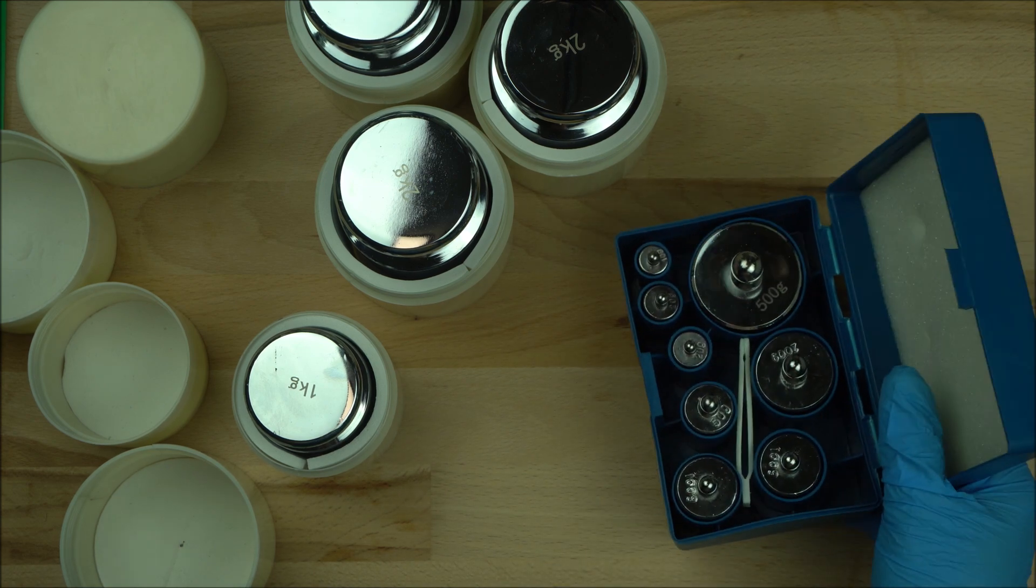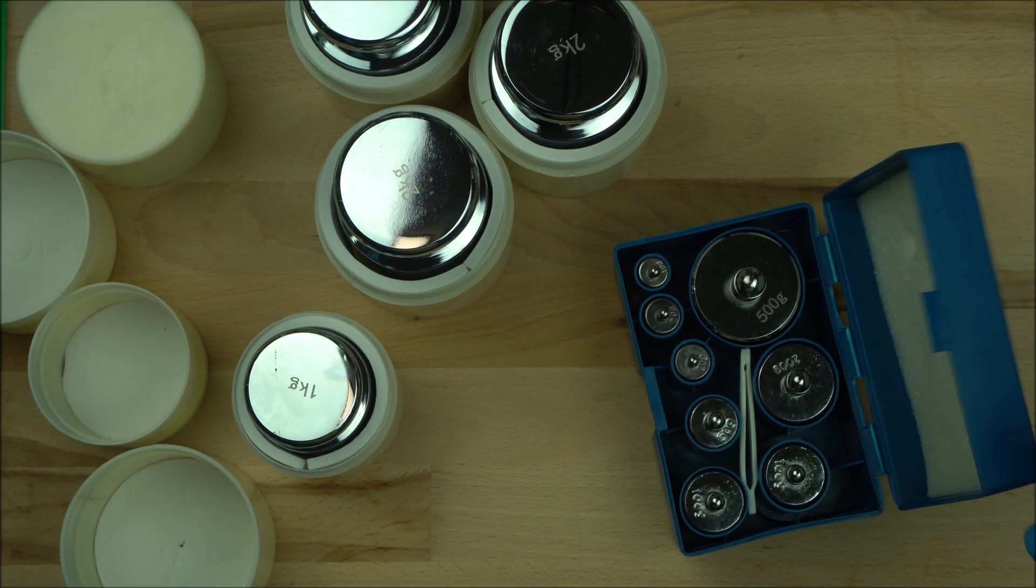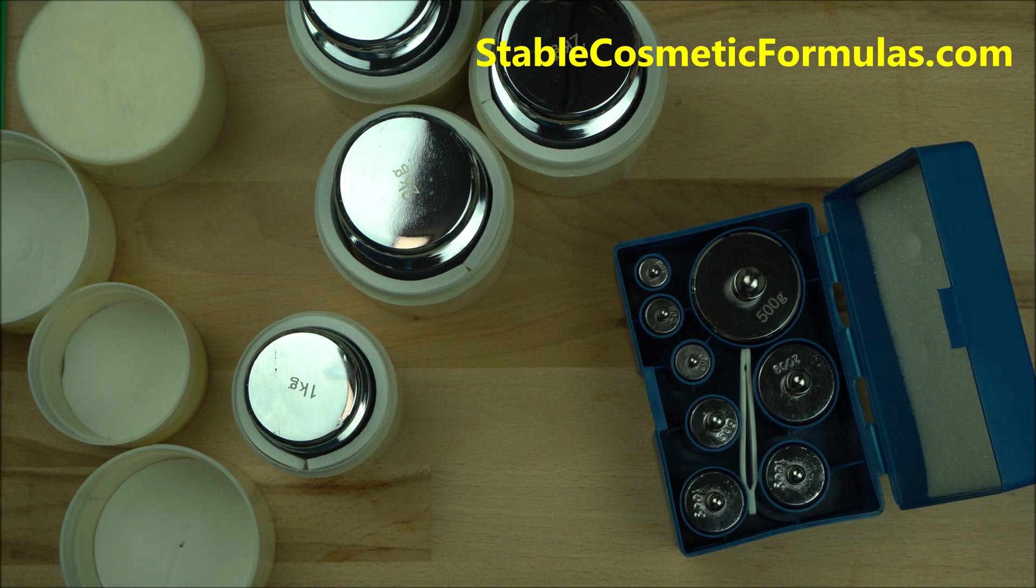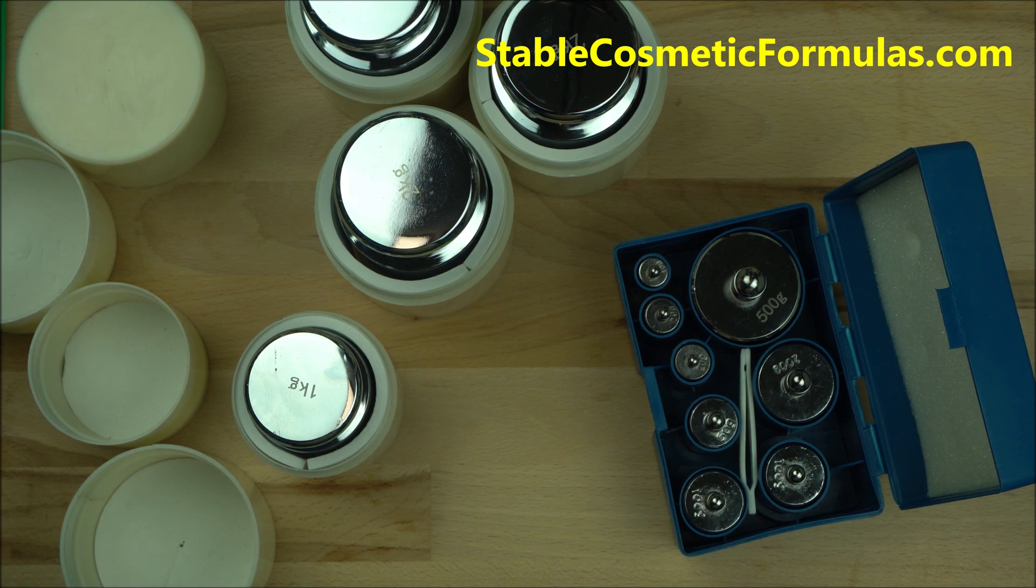That's about it for this video. I just want you guys to save money just as I do also. So this is how you save your money and get good quality calibration scales that you can use to calibrate any scale that you have in your lab or even at your home formulation lab.